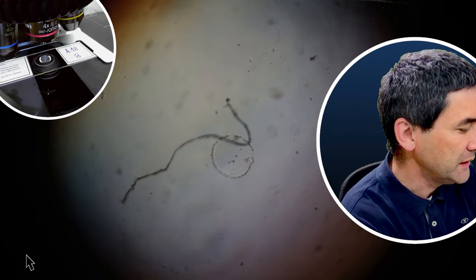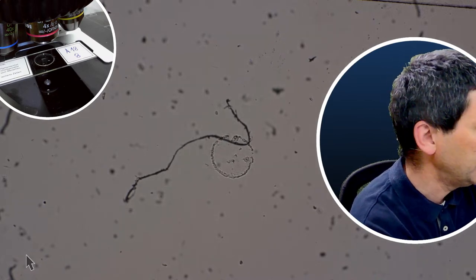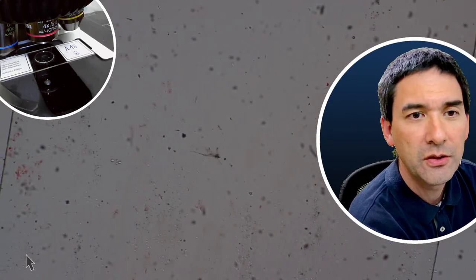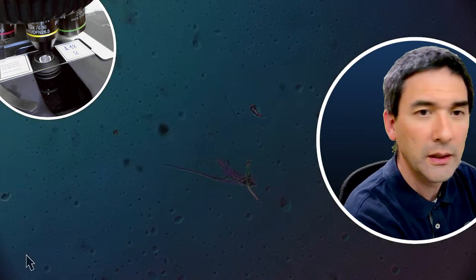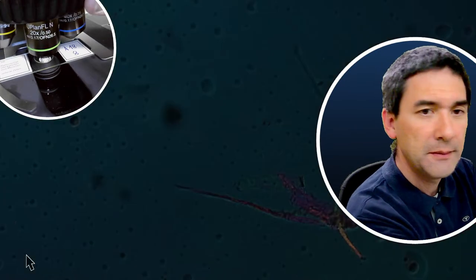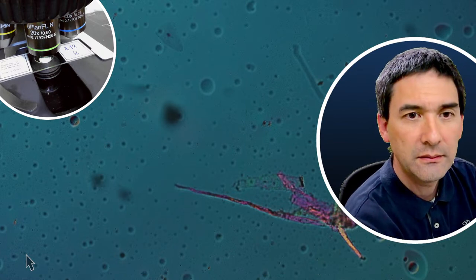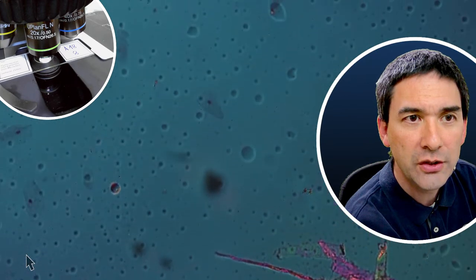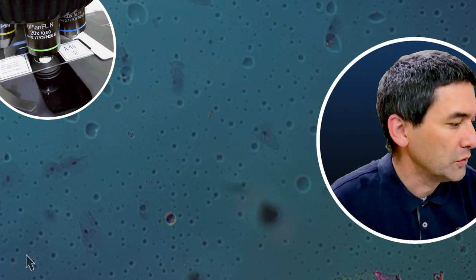Yeah, of course, there is a little bit of dust and dirt on here. I will try to find the place first. It does take me a little bit of time to find the cells. You see that there is quite a bit of dirt on here as well. Okay, I'm just going to zoom in a bit. So these are now basically human epithelial cells, and you're not going to see anything here quite well. Well, actually, I do already see them, but it illustrates that they are very, very difficult to see.